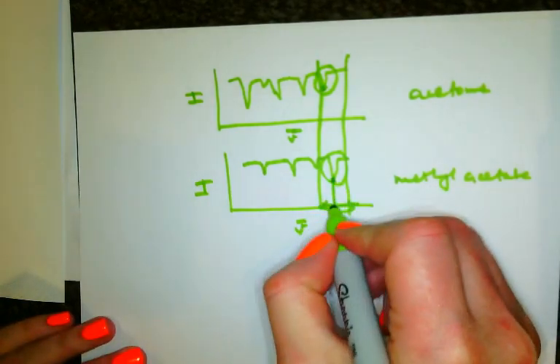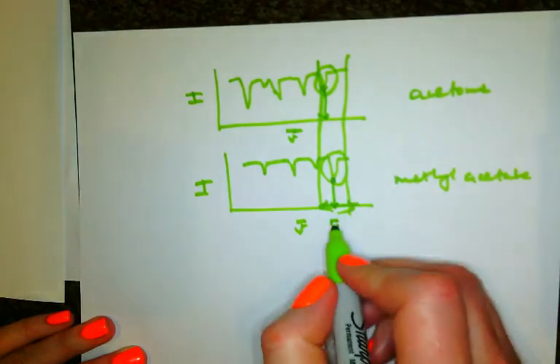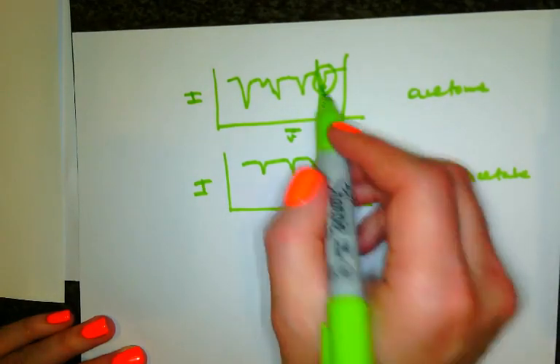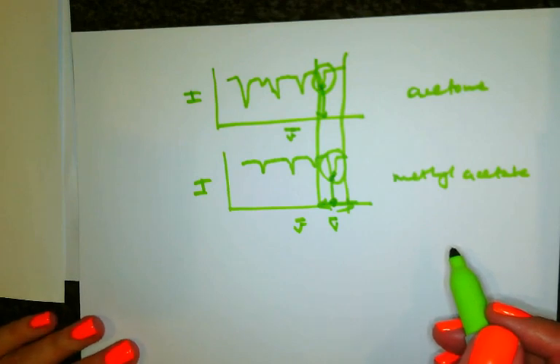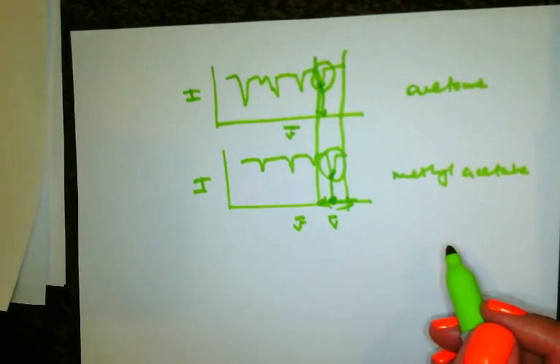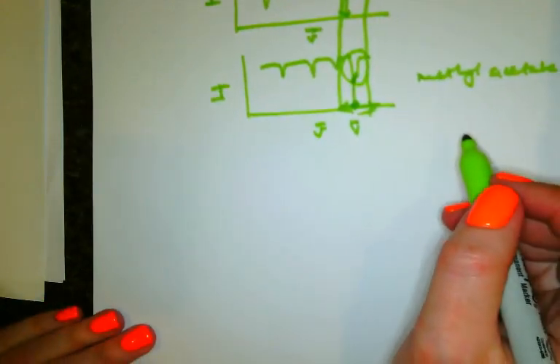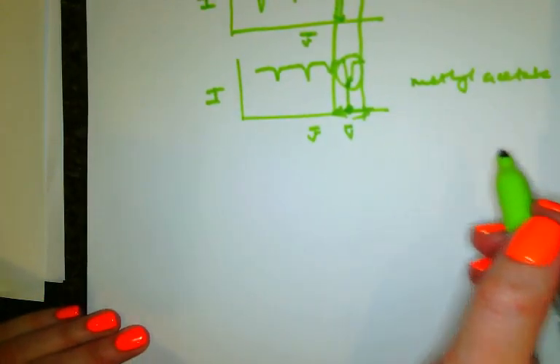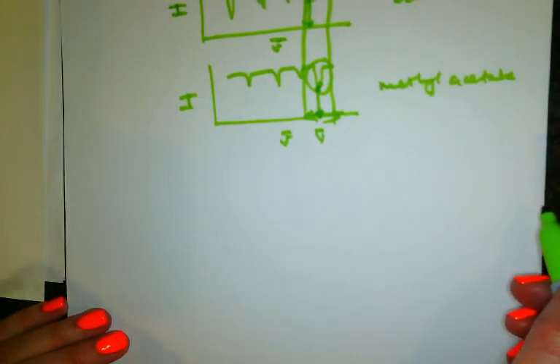So you read off the wave number for the carbonyl peak from the spectrum for each of your molecules. And once you have that information, you can use that to calculate the force constant K for that molecule.